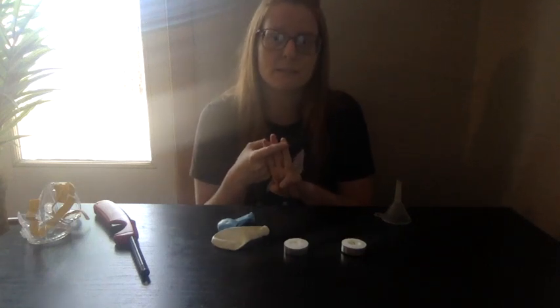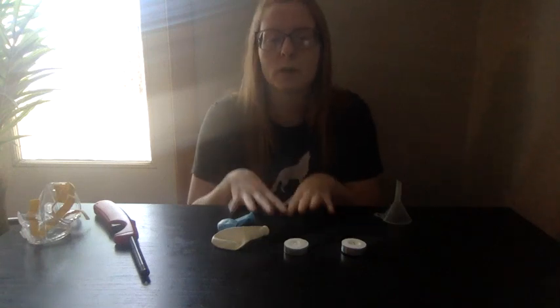Now, we've already previously shown in our labs 1 through 5 that it sticks to itself, it sticks to other substances, and it dissolves many substances. So, this lab is going to show you how water can absorb large amounts of heat.